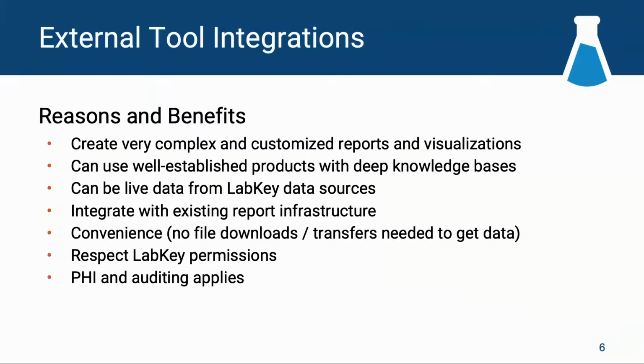So in addition to the built-in visualizations Corey mentioned, LabKey also integrates with a wide variety of external tools. Those external third-party tools allow LabKey users to create very complex and customized reports and visualizations using well-established products with deep knowledge bases. Data presentation on the third-party tool can also be live, so that when data is updated in LabKey Server or new data is incorporated, it will automatically update on the integrated tool. They can also integrate with existing LabKey report infrastructure, so analysis can be done on a centralized platform.